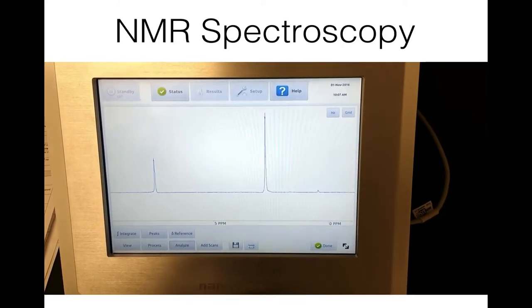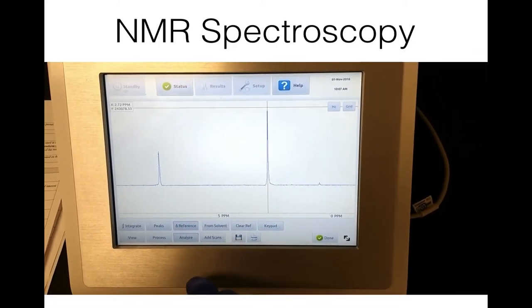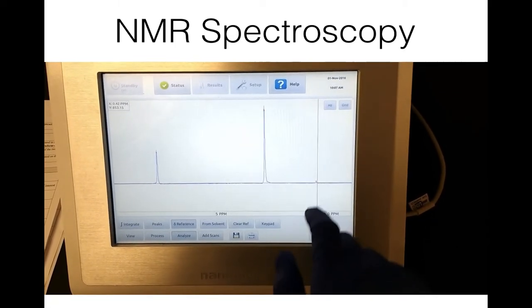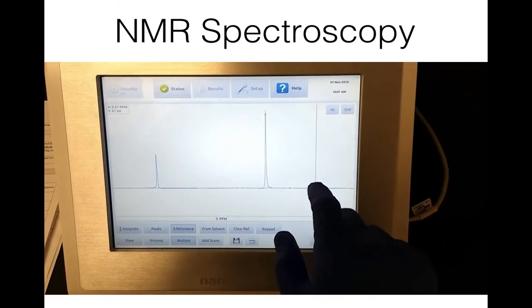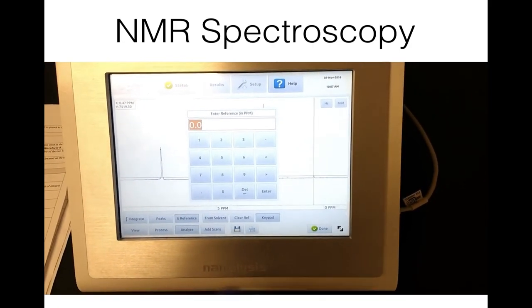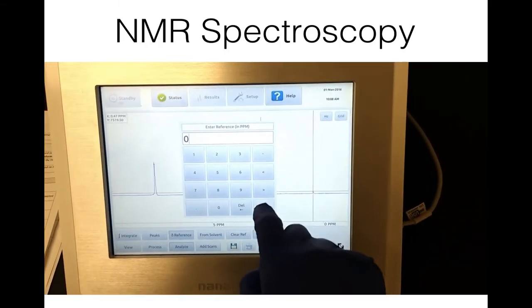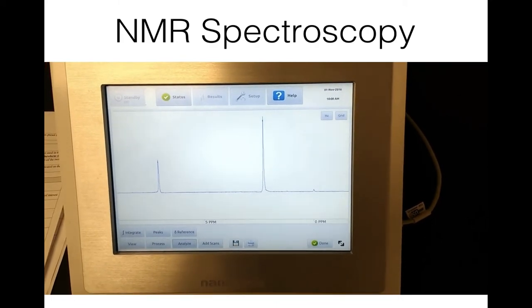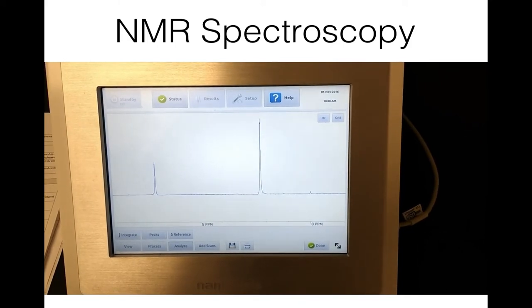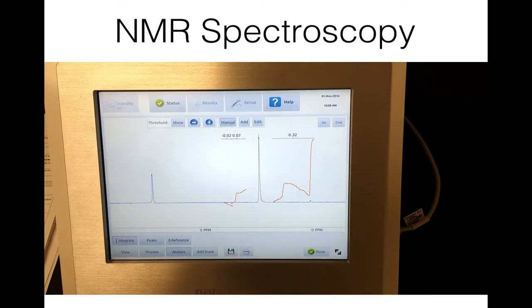Next, set the chemical shift of the TMS reference to 0 ppm. The TMS peak is usually the one all the way to the right, and close to 0. After that, integrate the peak area of each type of hydrogen.